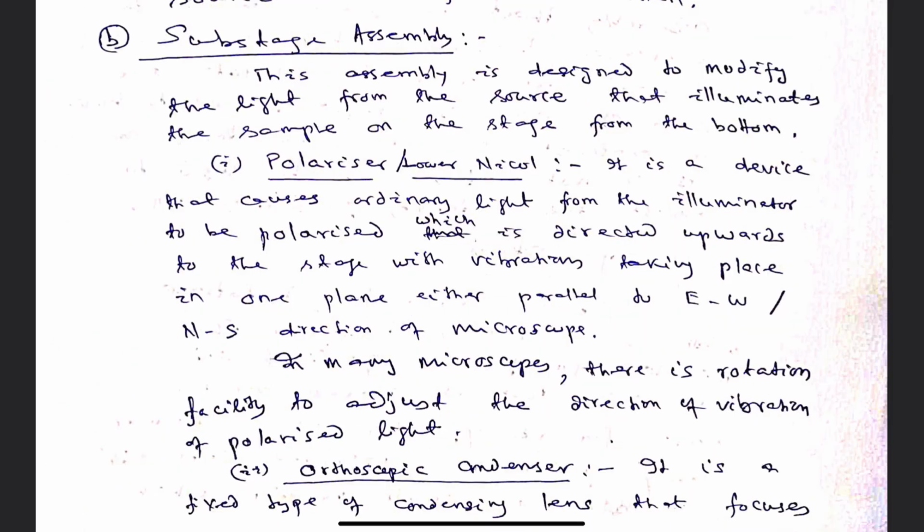Now we will discuss the substage assembly, the components which are fitted below the stage. Among them is the polarizer or lower nicol.